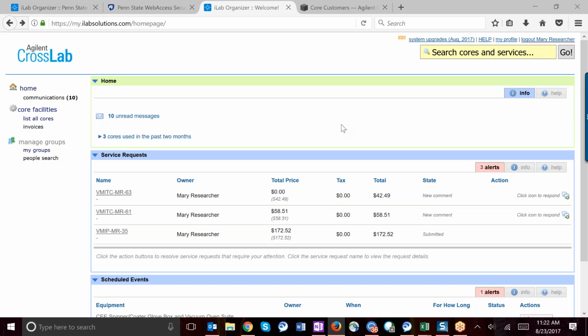Honestly, the most common one that I've seen with my cores is 24 hours before the reservation starts. That's when they usually set that email notification to go out. But in some situations, they've set it to go out sooner or later. So it does depend on the calendar and what the core has determined would be appropriate for that. Thank you. My pleasure.